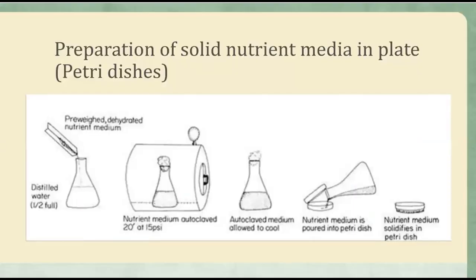After that, now this is your work. What will you do when you carry the sample into the laboratory? The first thing is that you have to increase the population of that microorganism so that you can easily detect it through a microscope, because in the sample it could not be directly detected. So what will you do? You have to first prepare a nutrient media or a culture media for that microorganism.